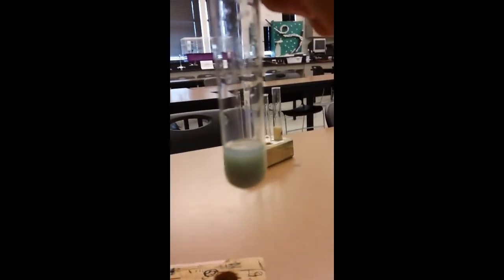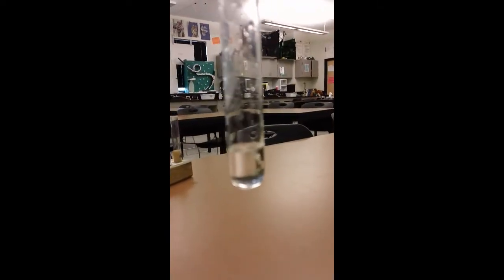So here, mixed up. Ooh, notice this. This is my Cr. Okay. Here I have my Fe. Record any changes in your table. Here I have my Zn, my zinc. Okay. This is my potassium, K. And this is my Cu. Look at that.